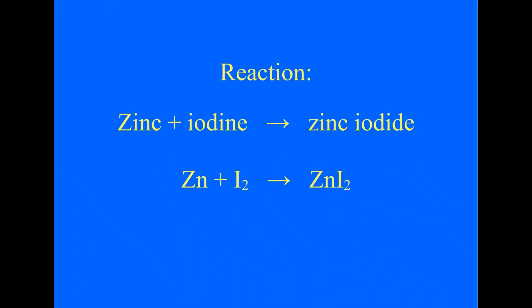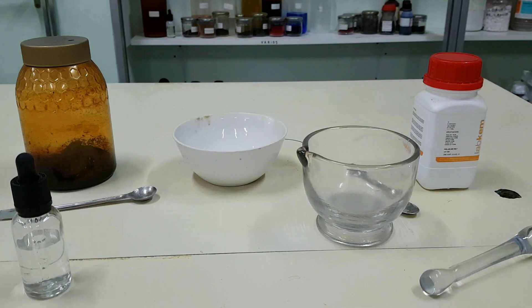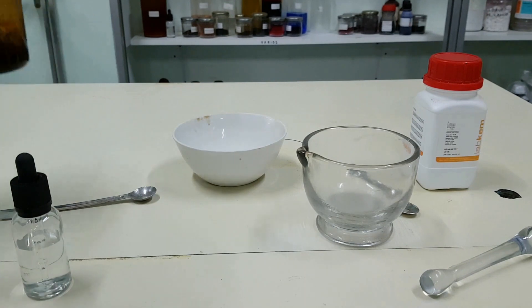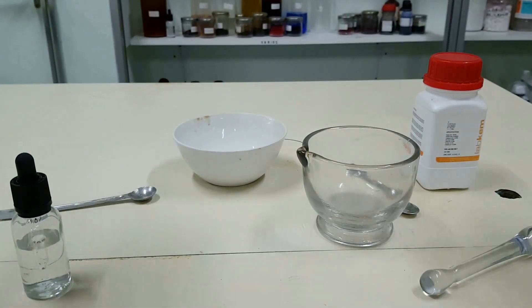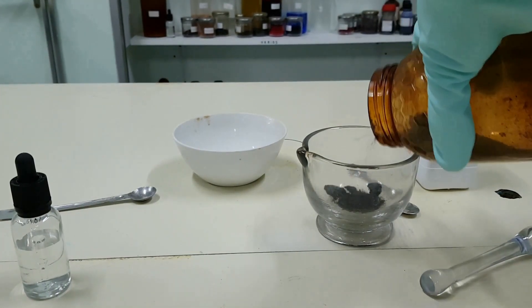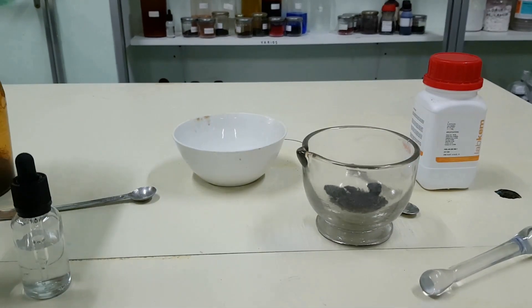Let's make the zinc react with the iodine, thereby obtaining zinc iodide. This is the iodine. As it is clump-shaped, put the iodine into a mortar and crush it.